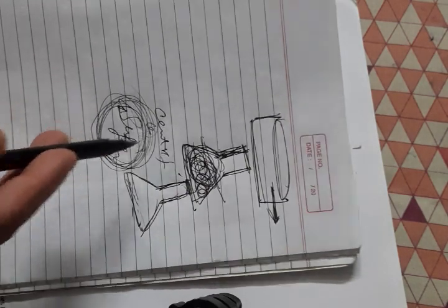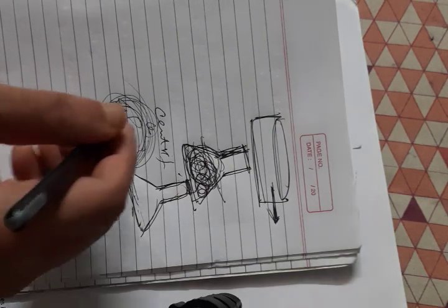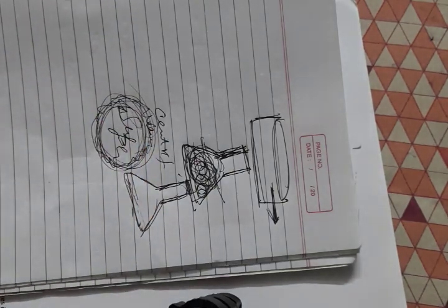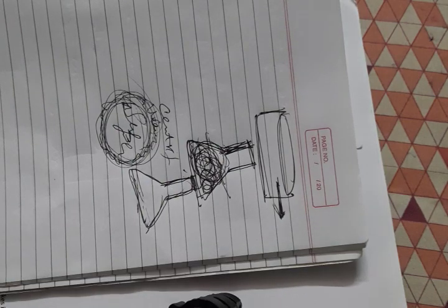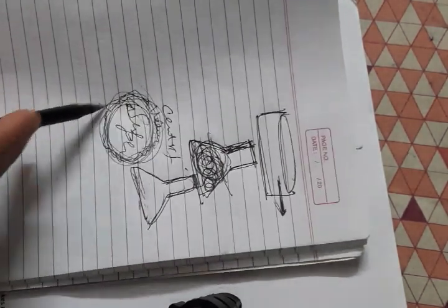And so ammonium sulfate, I guess, is added. I've forgotten, by the way. Ammonium sulfate or something is added, which precipitates out the protein, and then that precipitate is taken out, and somehow the amylase is extracted from it.